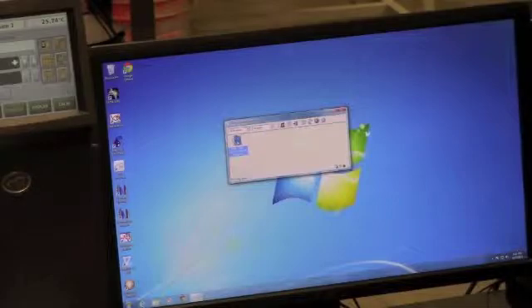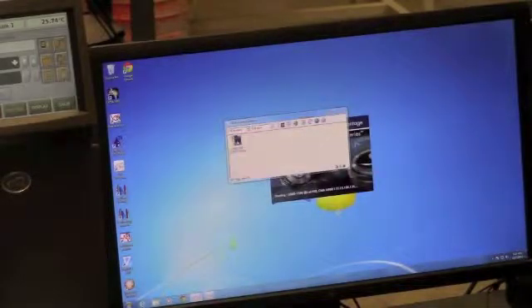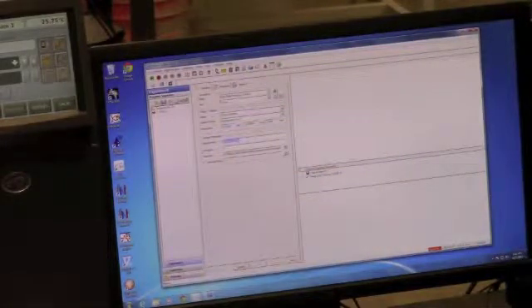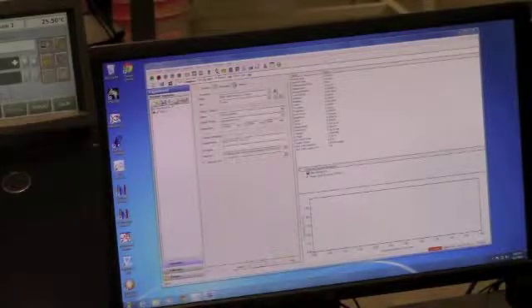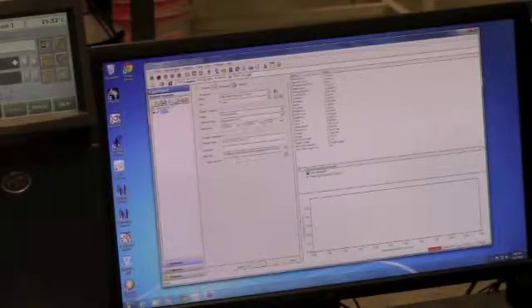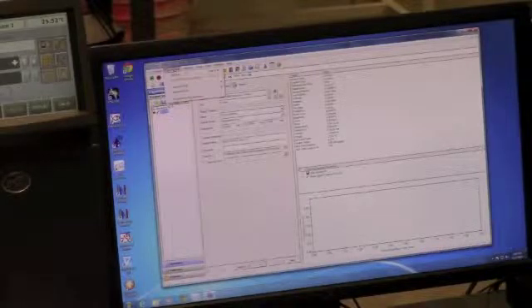The first thing that should be done when preparing to run an experiment is to open up the DMA interface on the computer next to the device. Once this is open, to set up an experiment, select the Experiment tab and click on Wizard.